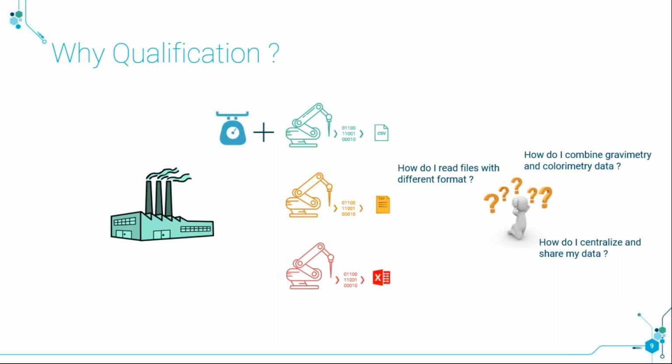These devices give us many different output files in different formats, and we always struggle to centralize everything, to combine the information, to join the information from different formats. To answer this, we wanted to have a collaborative platform for all the robotic equipment in the lab, with an easy way to centralize and share the data and combine the data together.